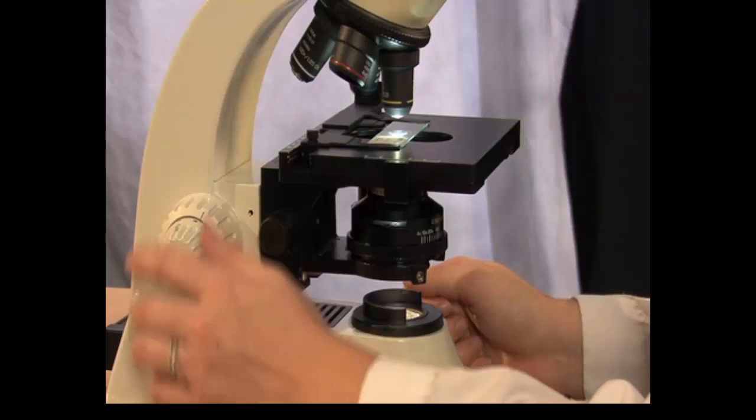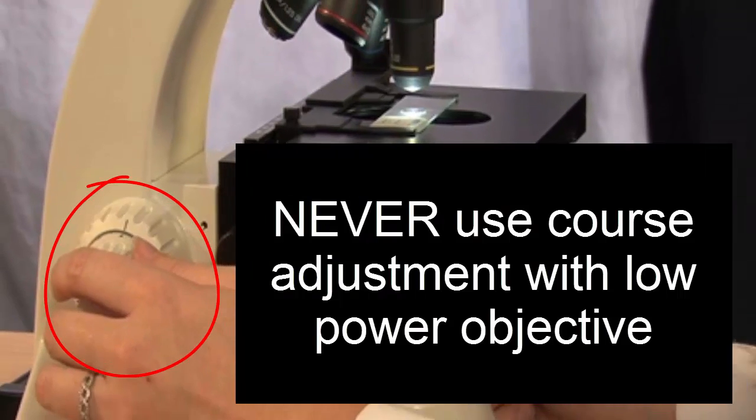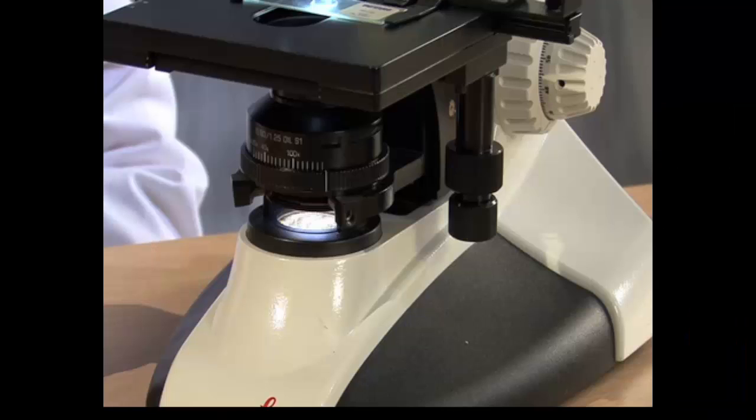To get a sharp, crisp image, use the fine adjustment knob only. Never use the coarse adjustment knob with this objective. If you need more contrast, you will have to adjust the light accordingly. Finally, adjust your letter E so that it is in the center of your field of view using the stage adjustment knobs.